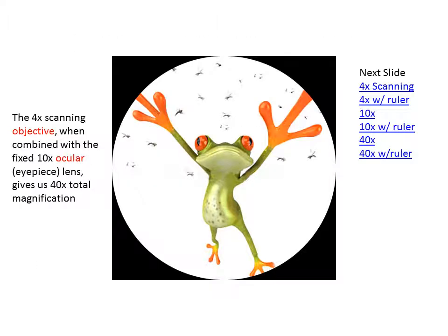So these slides have their own explanations, so I won't really dwell on them as much, though I will try to abstract in another set of slides. But the point is, I designed these to look like roughly the same change in magnification that you would see on our microscopes from 4x objective to 10x and 40x. So what we'll do when we're trying to estimate the size of an object is first understand how big the field that we're looking at is, and then compare an unknown object to that field.